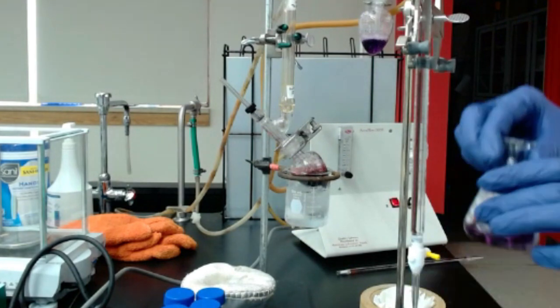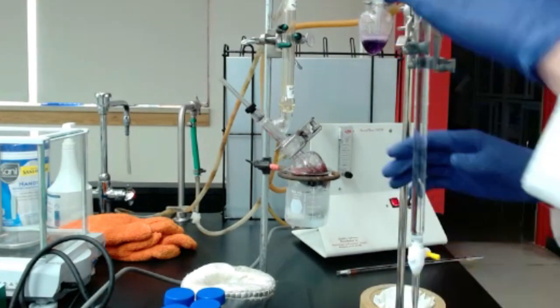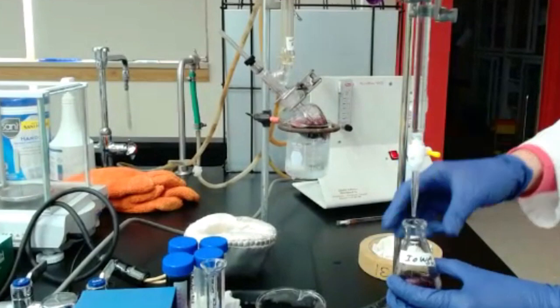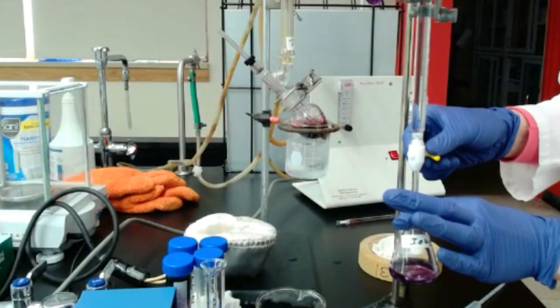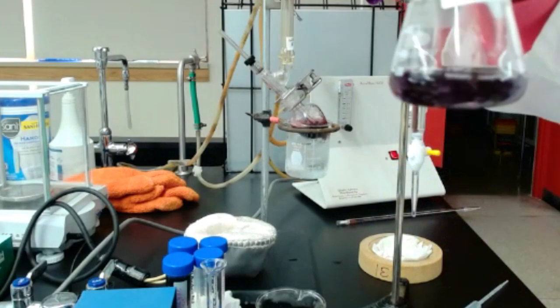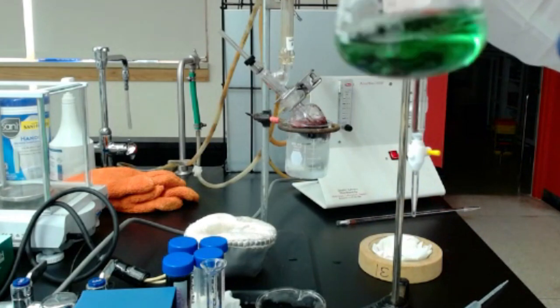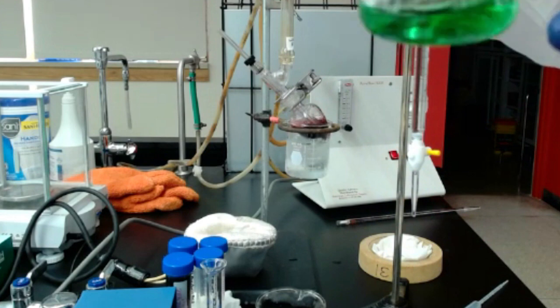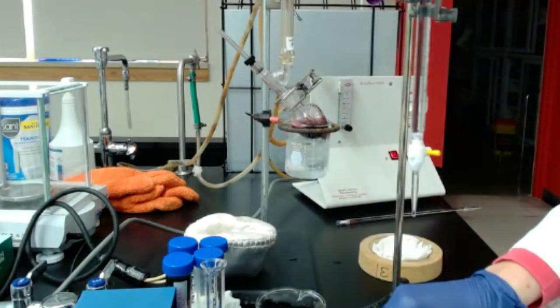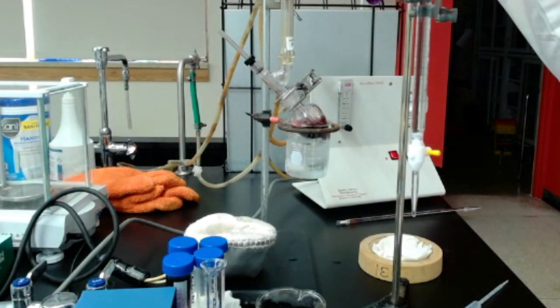Now you're going to start the titration of this total SO2. So I take that flask, and I come just on the bottom, and I'm going to add a few drops until the color comes back to green, pale green. Make sure it doesn't touch the walls. You can probably see, no, you don't really see, but it's pale. It's pretty purple, but it's turning green, right? All right. So I did add enough sodium hydroxide. Now that it's back to pale green, I'm going to record the volume on my burette. That's going to be the final volume of sodium hydroxide. And I currently have 18.1.